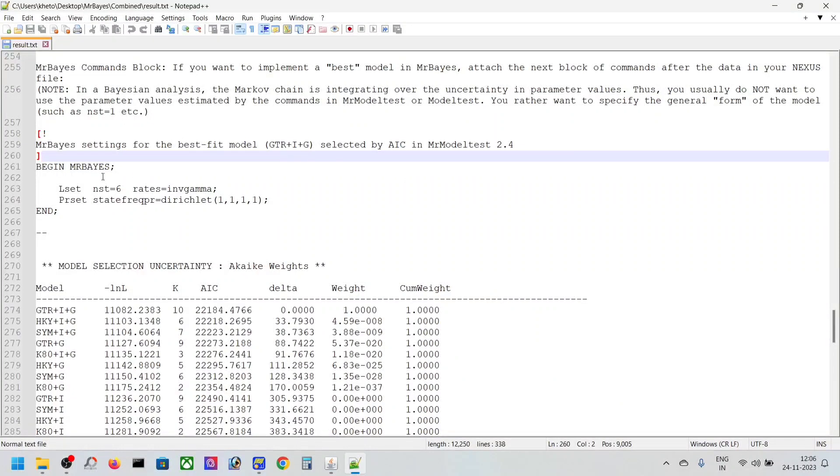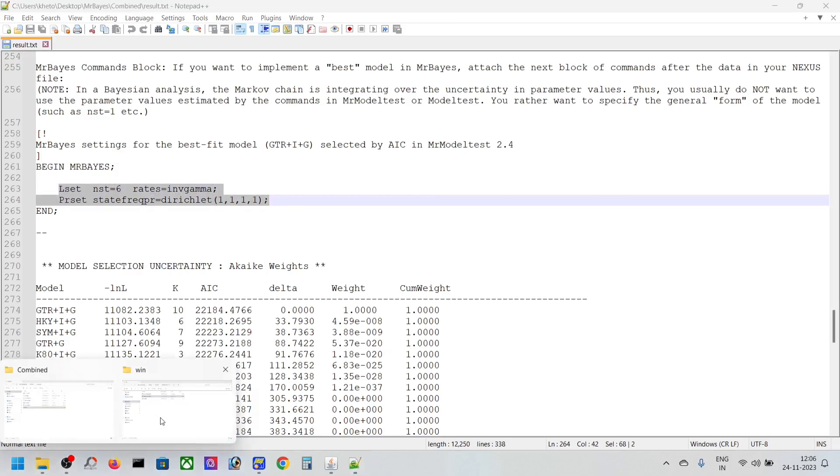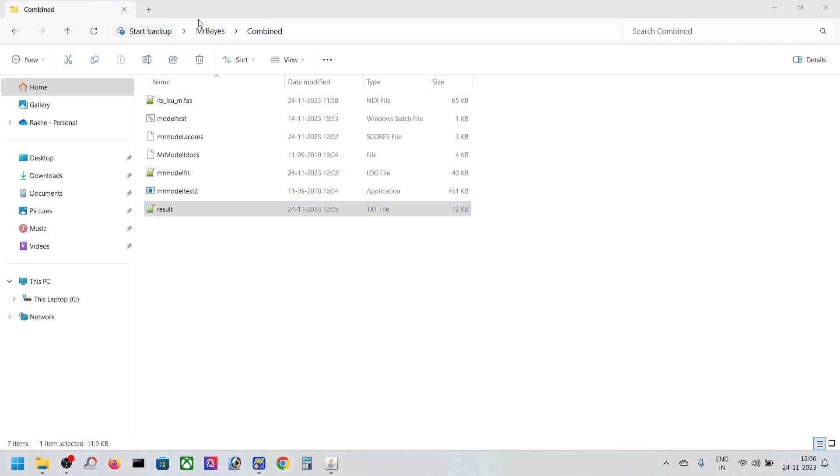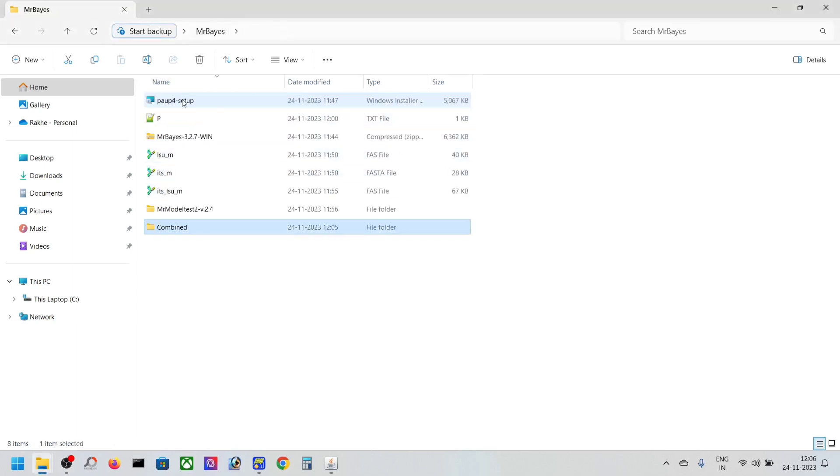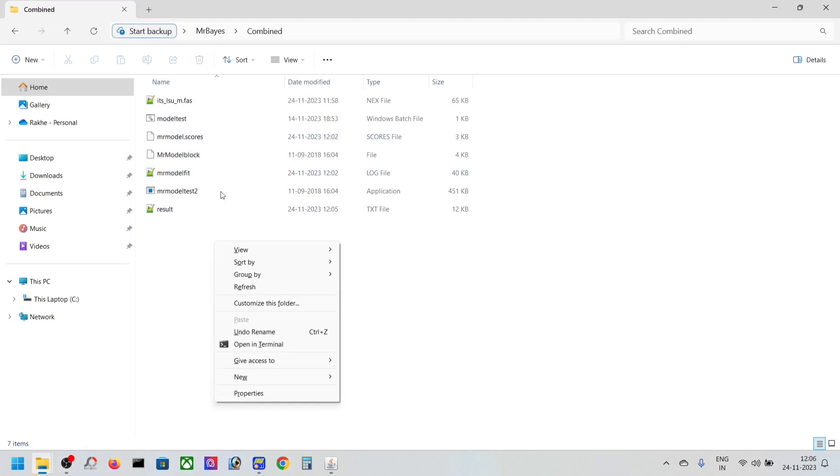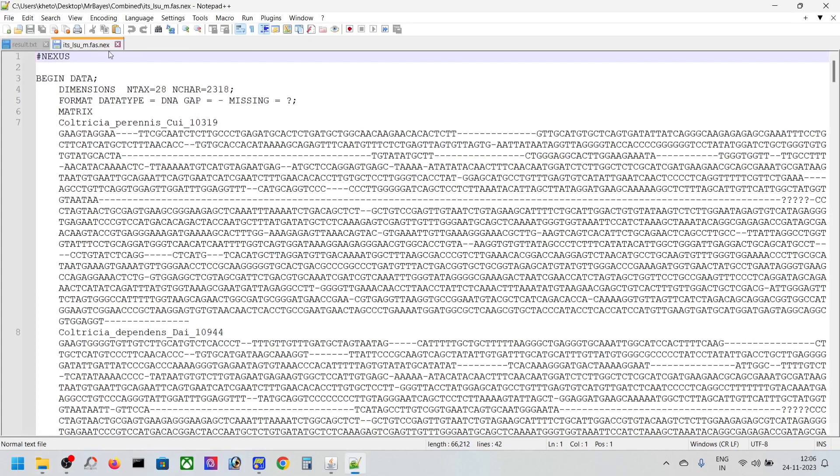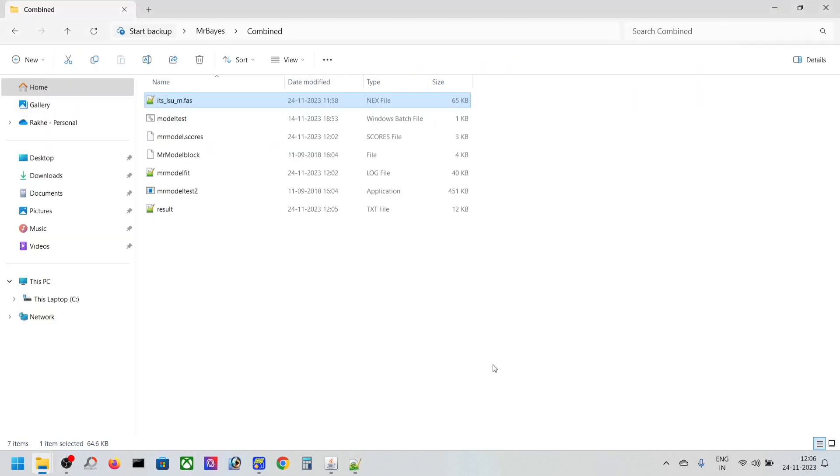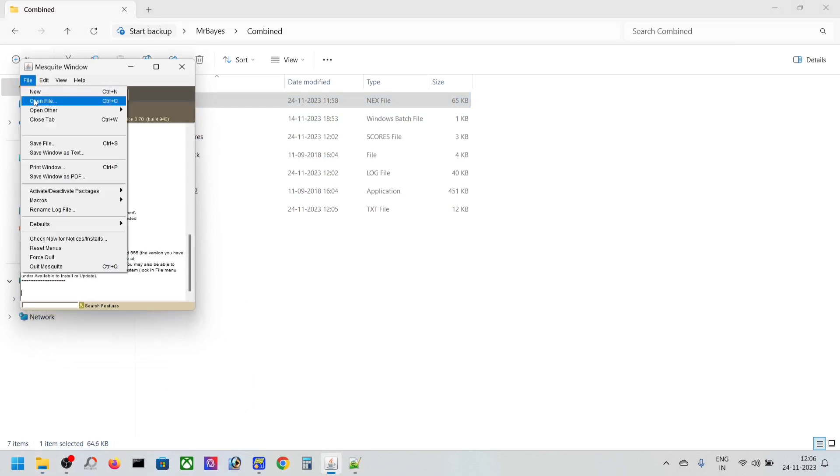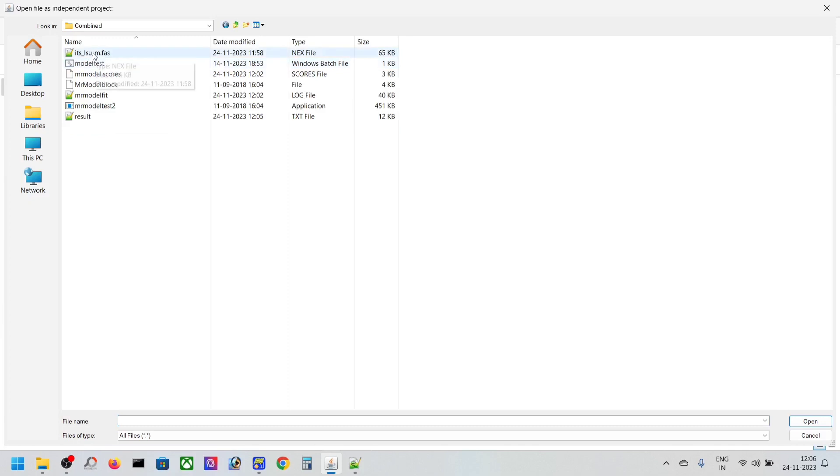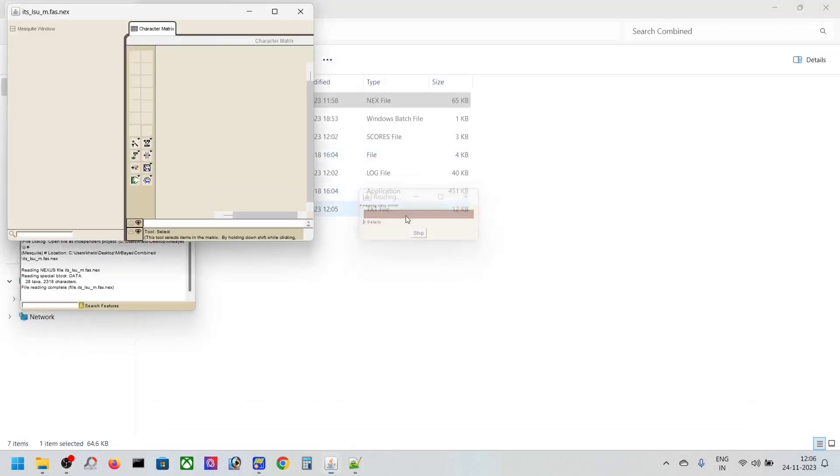So now what we're going to do is copy this region, and then close it. Don't open the Nexus file yet, just keep it here for now. Don't copy it yet.